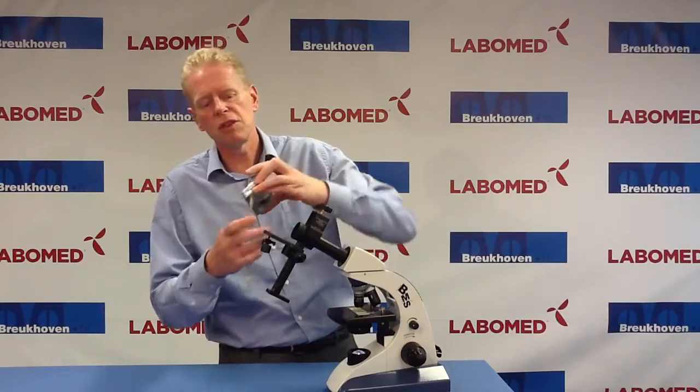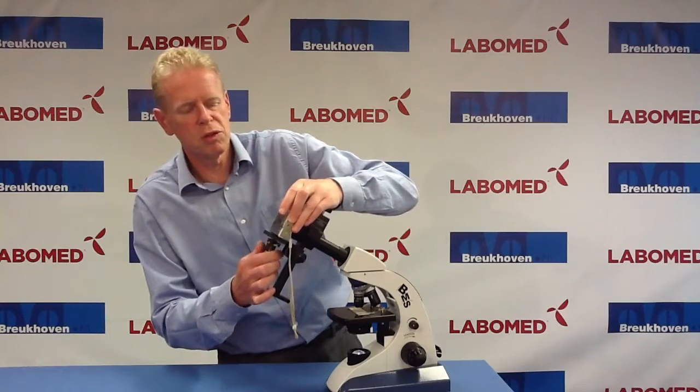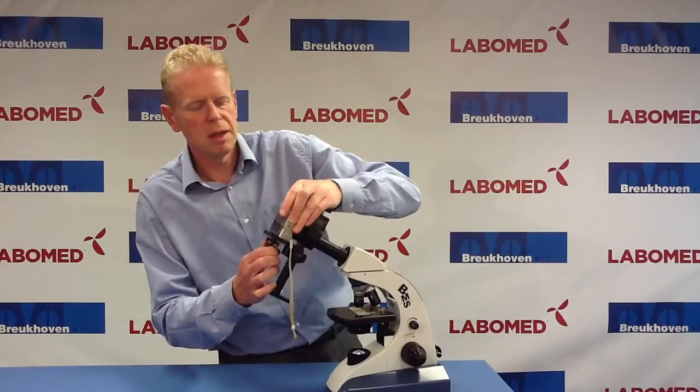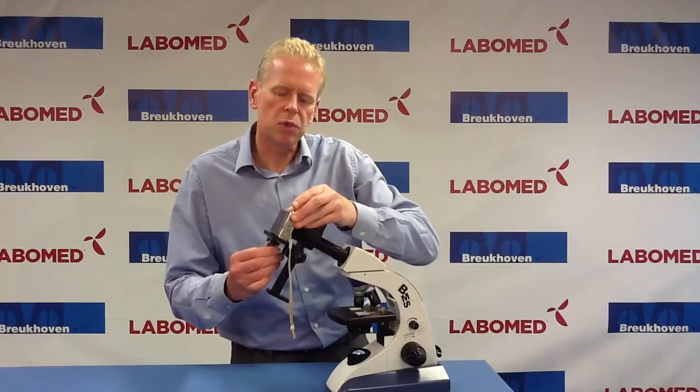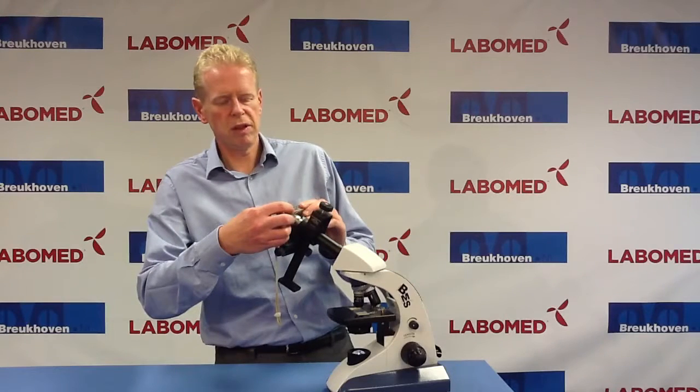On every camera on the bottom you will find a thread. And this thread is used to connect the digital adapter to the eyepiece. I position it, switch on the camera, and turn it a little bit towards me to adjust it.